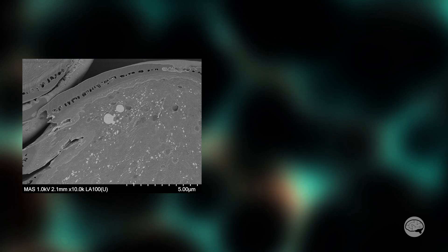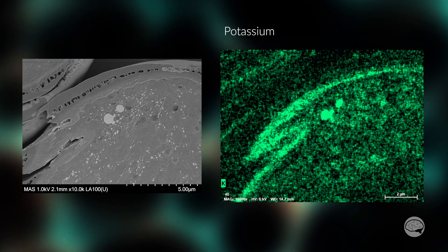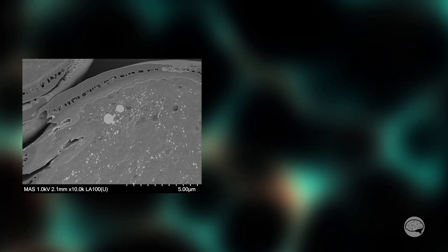However, because this is a plant, I probably could have guessed all of those things without even looking. However, some of the things I would not have guessed are the phosphorus, magnesium, potassium, calcium, and a tiny bit of what I think is fluorine. So let's look at all of these things individually.